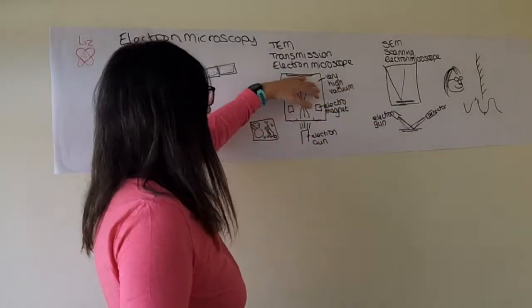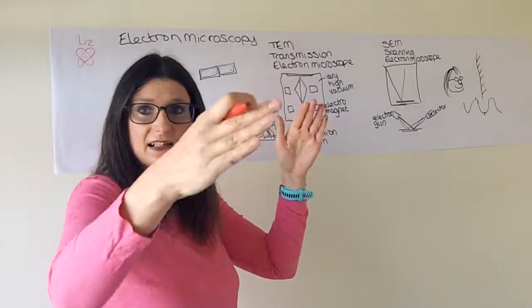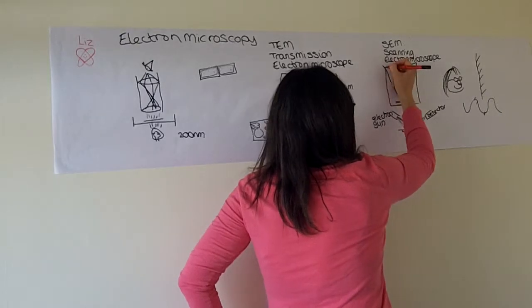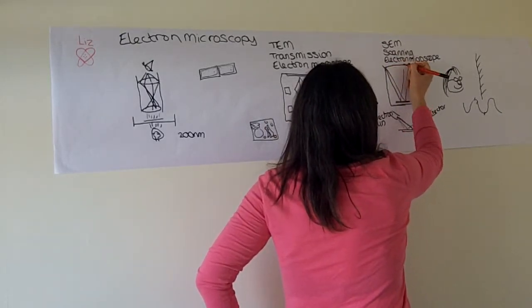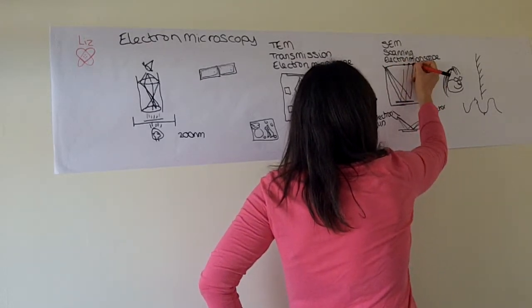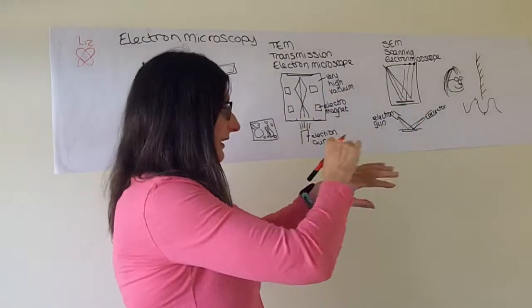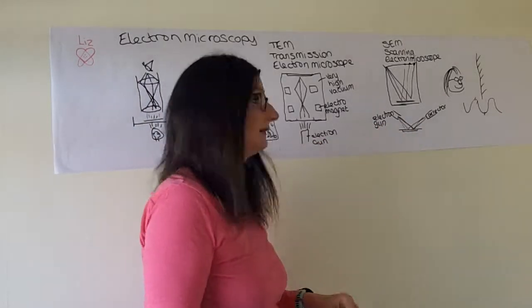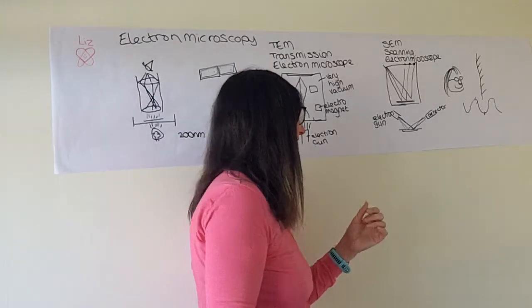They're done using a detector like this, but as it scans across, you get a dot there, and then if it goes there and there, you get a dot there, and there, until it's built up a picture, and the electron beam goes across, making little dots of electrons on the detector.